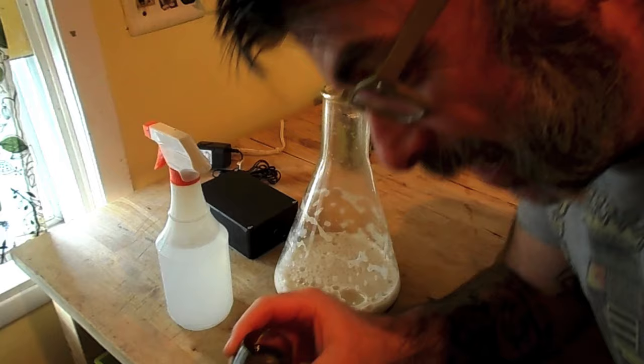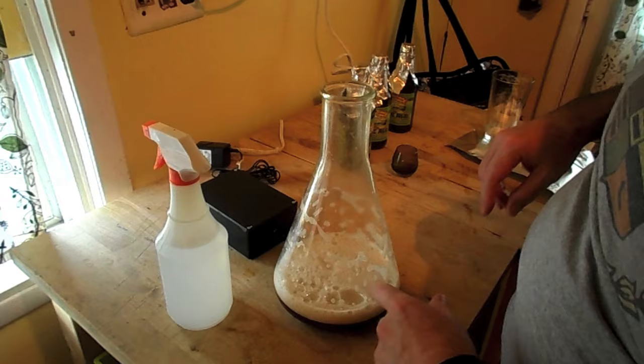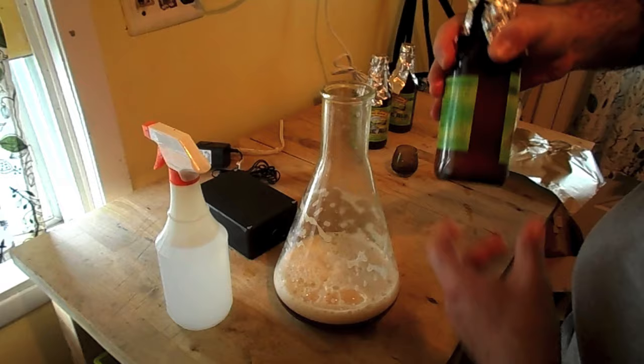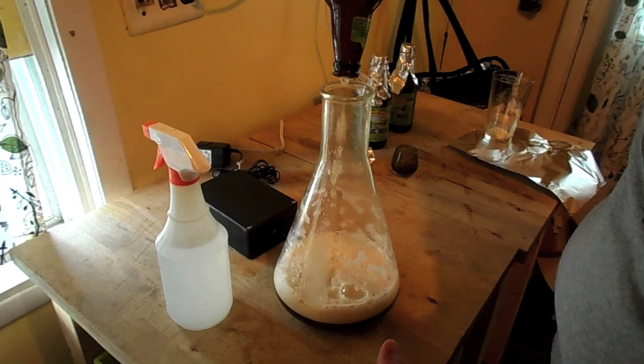Considering I've had three beers — stir bar, that's what this is called — I'm going to dump this into the star san and then into the Erlenmeyer flask. I have my beer that I had going. I'm just going to shake this up, kind of get everything all mixed up inside the bottle here, and then just dump it in. As easy as that. All right, that's one.